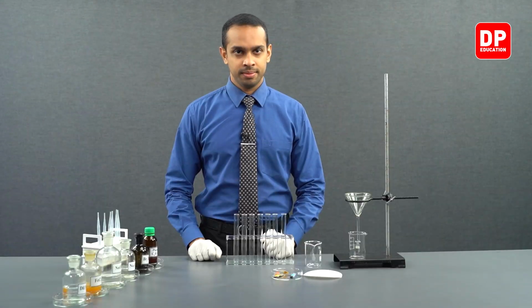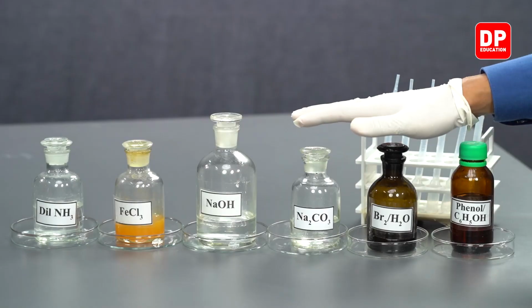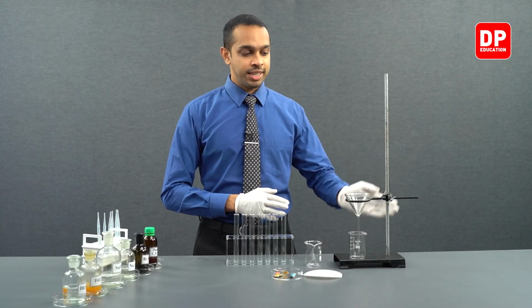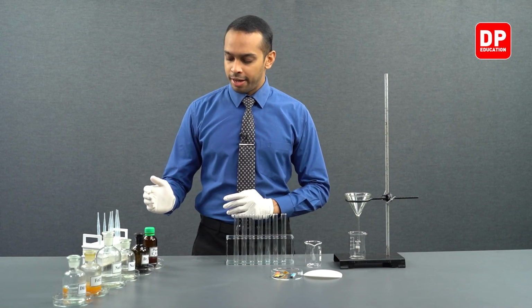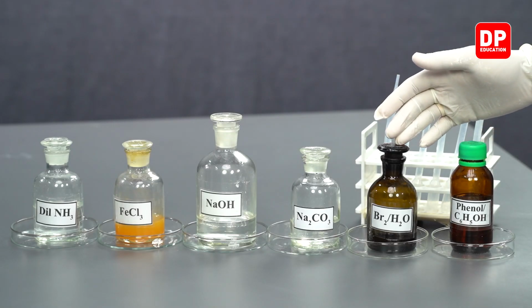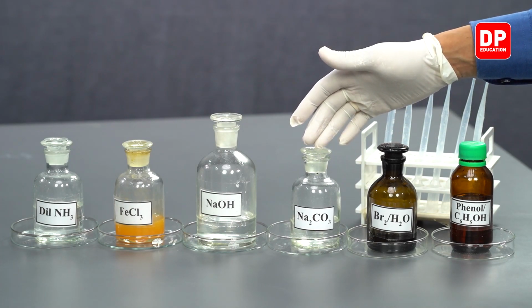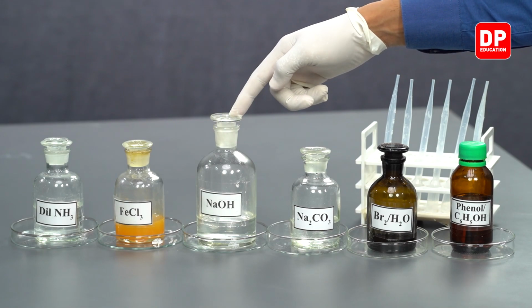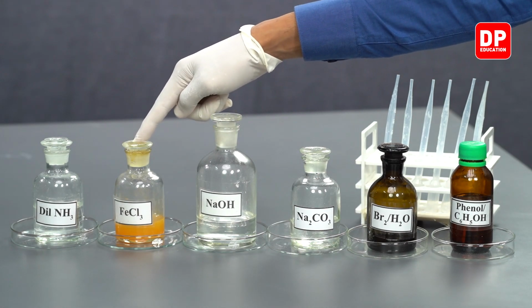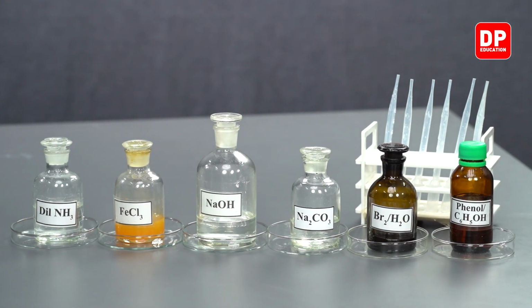Now, let's move on to our reagents. For this practical, we will be using these chemical reagents and this equipment. We have here phenol, bromine water, sodium carbonate, sodium hydroxide, ferric chloride, and dilute ammonia.